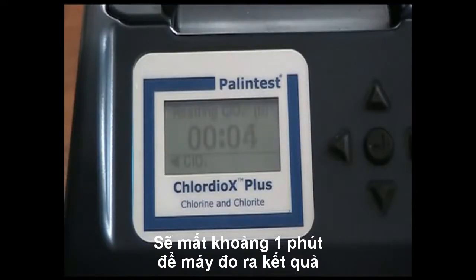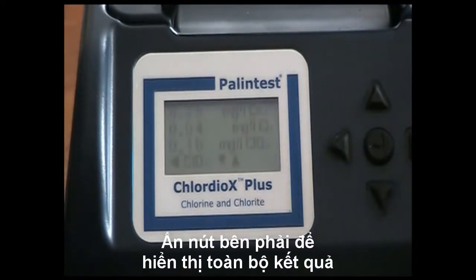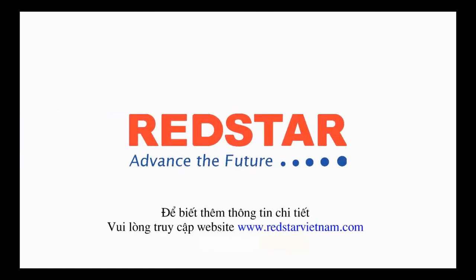Once the measurement time is complete, the protocol is complete. The result for chlorite is shown on the screen, and pressing the right arrow will allow you to see all of the results for all stages of the test. Press the down arrow to see the temperature of the sample, and the time and date for the test, plus a sample number if selected.